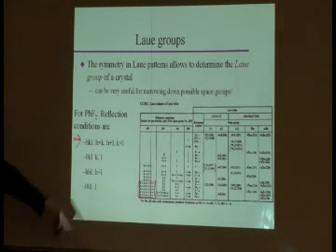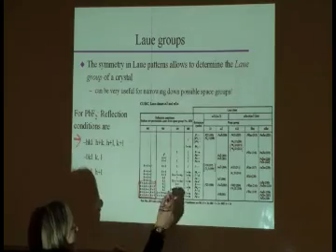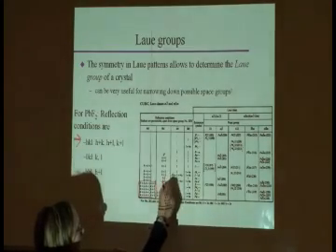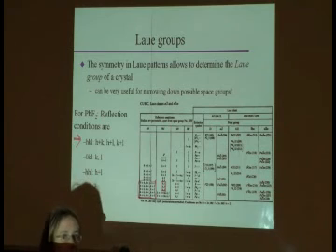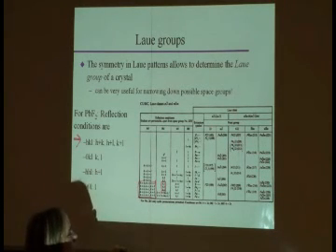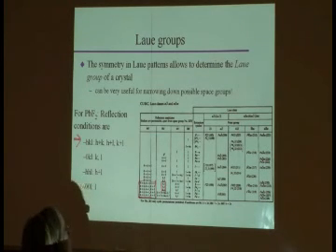0kl has k, l. So we look at this part, okay? And 3 out of these 5 lines have the k, l condition. These 2 have the k plus l equal 4n and k and l conditions, which we obviously don't have.